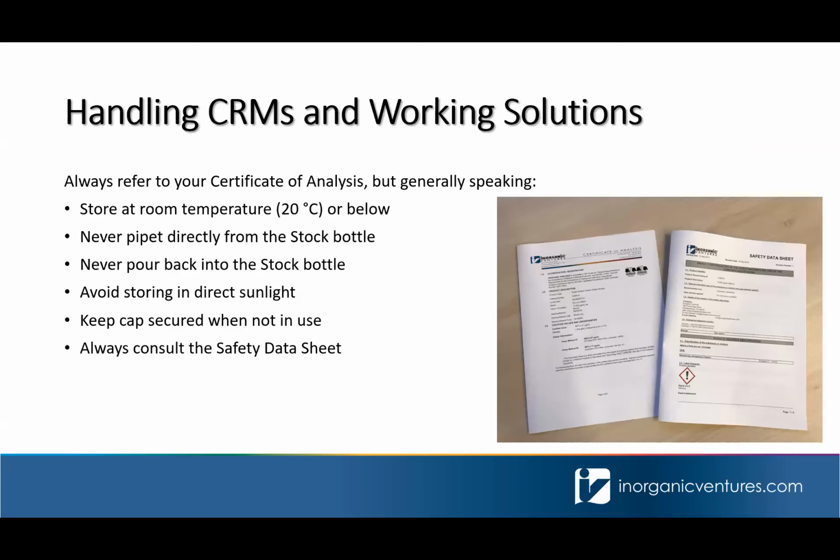If you're using commercially available CRMs, the C of A is going to provide information regarding proper storage and handling, but in general, the information on the slide is good practice for those lab prepared solutions that you can create. So in general, we say store at room temperature. So we're saying 20 plus or minus 4 degrees C or below. Refrigerated storage is not required, but it can't hurt, and we'll see that in just a minute.